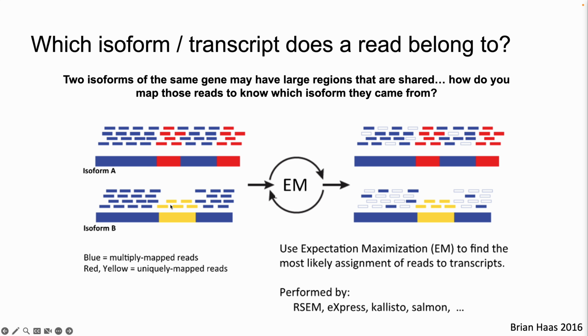So many of the modern mappers, and we're going to use Salmon, are just some of the ones that do a good job of this. They use an expectation maximization algorithm, and all that does is say, what's the average depth of the unique parts, and randomly associate the duplicate mappers to one or the other, so that the average read depth is the same as the unique parts.